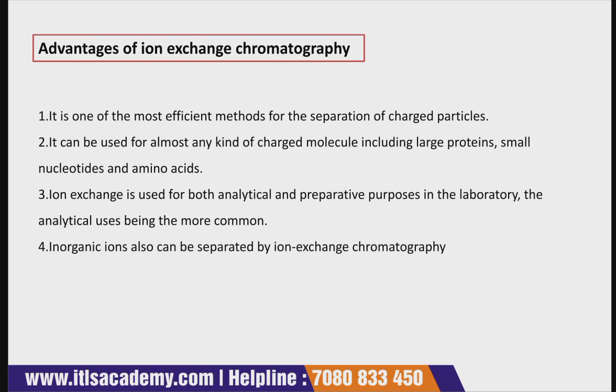So it is not only limited to an analytical technique in the laboratory. Ion exchange can be used for both analytical and preparative purposes, the analytical uses being the more common.